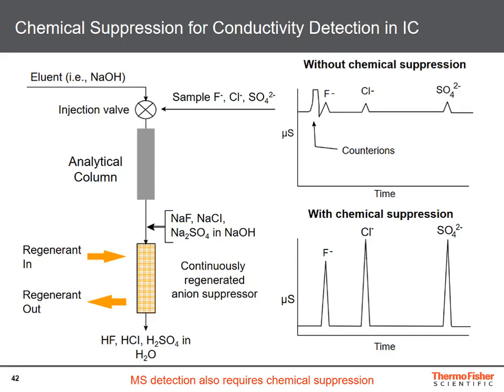We should also not forget that the conductivity detector itself, per se, is non-specific. Why? Because it cannot differentiate where the conductivity is coming from, the analyte species or from the mobile phase. It cannot differentiate between anions and cations. And we all know and have learned at university, we should not use non-specific detection in general unless we have no alternative.